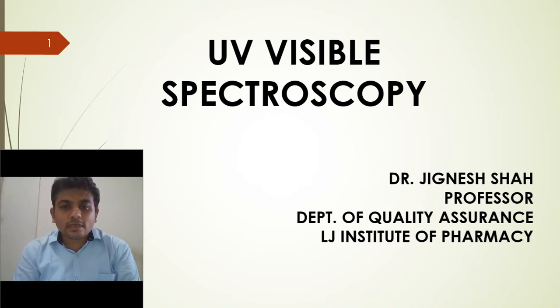Dear students, in the last class we have started with UV visible spectroscopy, where we have gone through the basics of radiation, how the radiations are being formed, what are the different terms which are involved with radiation, such as wave number, frequency, wavelength, how energy is associated with all these terms, what is the correlation of wavelength, wave number and frequency with the energy of radiations, and also we have gone with the important points or characteristics with respect to radiations. In today's class we will continue with the same topic, that is UV visible spectroscopy.